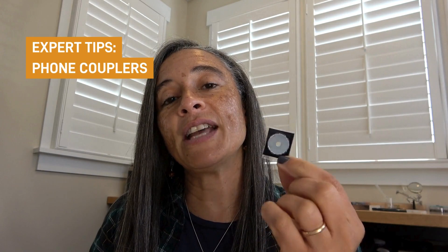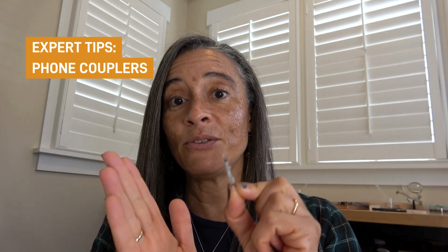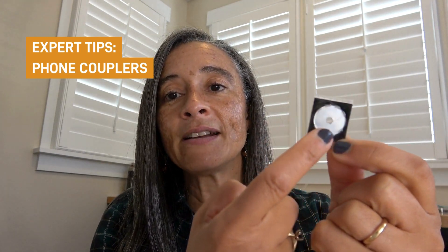You are now going to have to physically and manually line up your phone coupler with your Foldscope. The new coupler does have some features that help you with this. There is a raised outer ring along the outside of the washer, which is just the right size to grip onto the outer edge of the lens magnet. And there's a hole in the middle — this hole is exactly where the lens will go once you get it locked on.